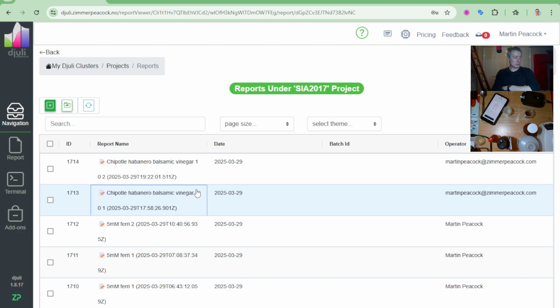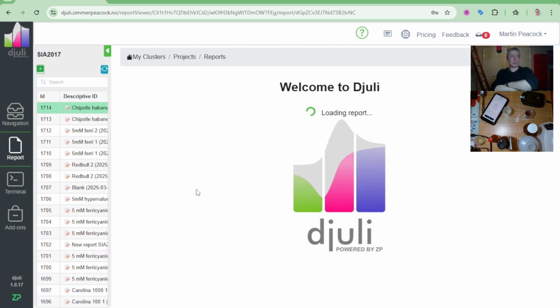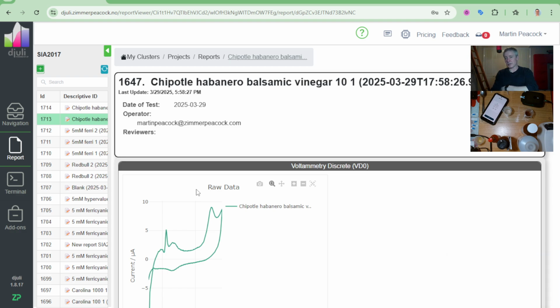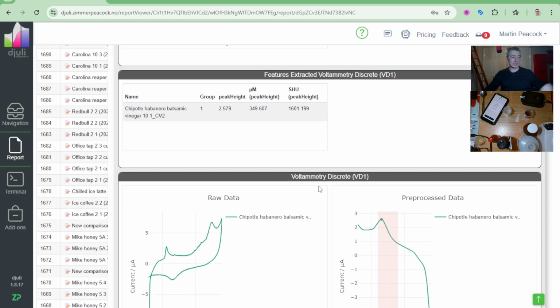So you can do an average of those two, which will come out about, I'm going to make this up slightly, it's like 1,580. But you can see that repeatability is really good at the test. And so you can generally say that's about 1,600 Scoville heat units.